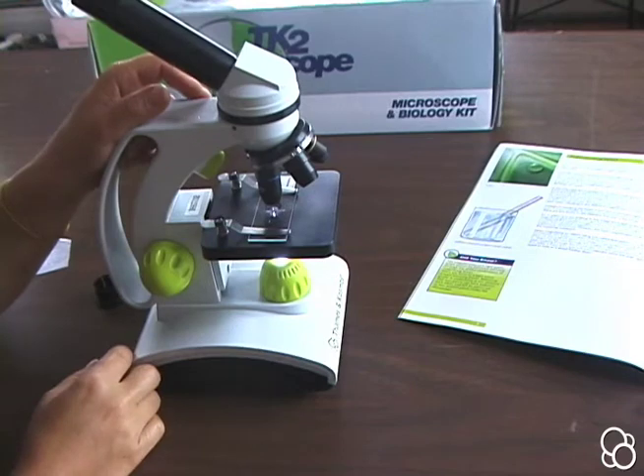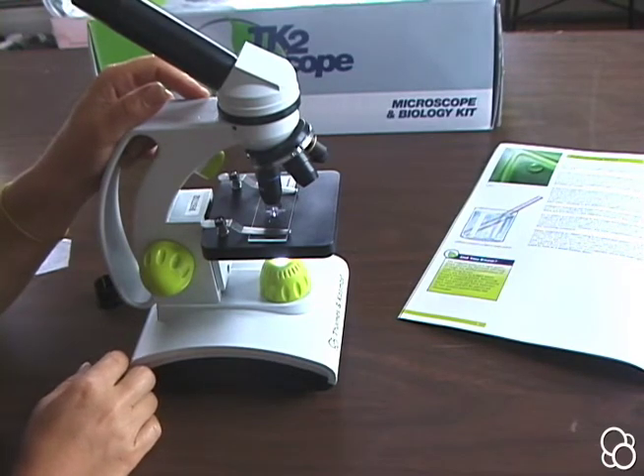So now you know how to use your microscope and you're ready to move on to other experiments in this kit.